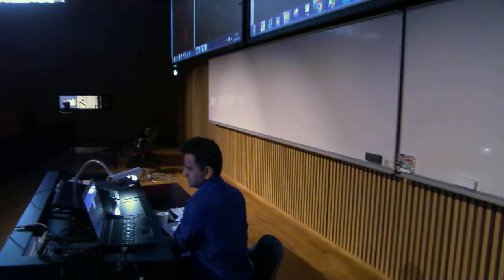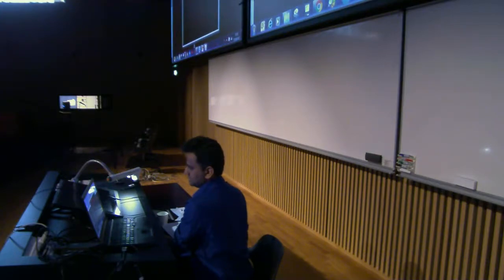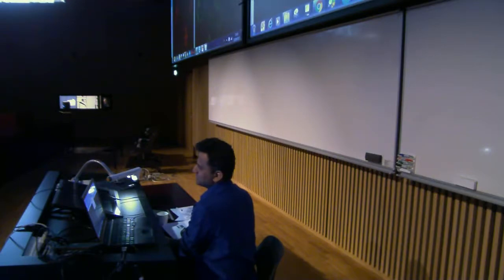Let's see what happens to that. You see here now? It's added. That's because we haven't selected the proper image calculator, and here because we are selecting the same image, we should select this one. Okay, and then you do whatever you want to do.